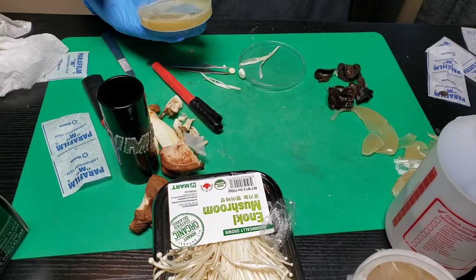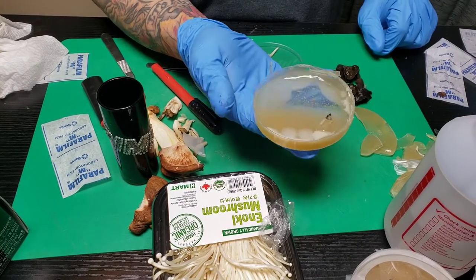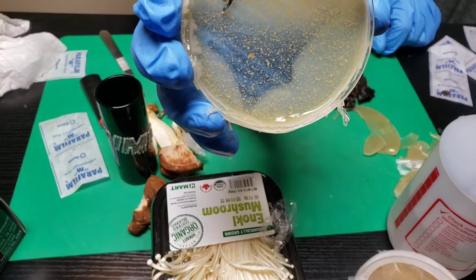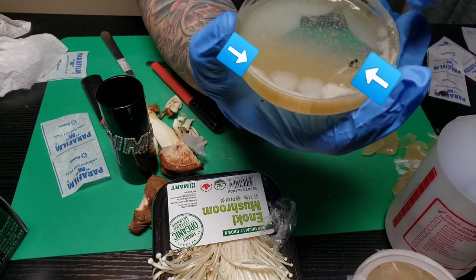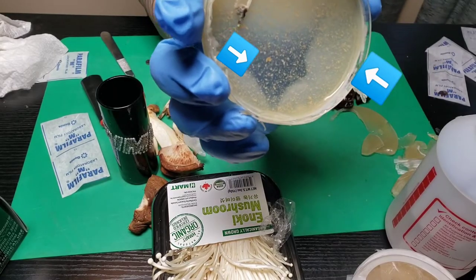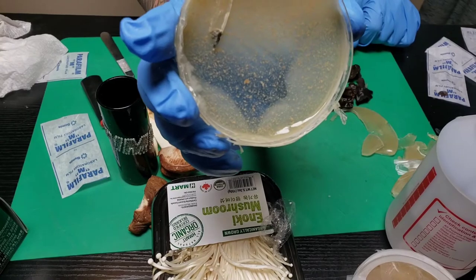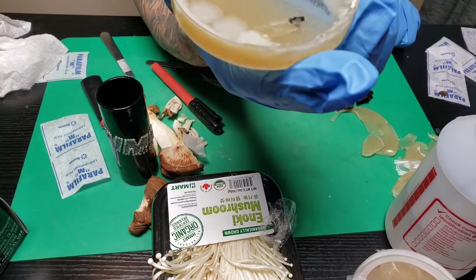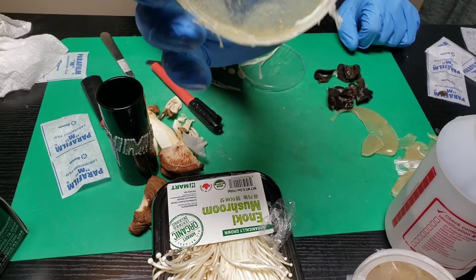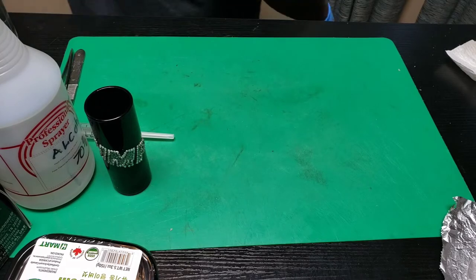I just wanted to show you real quick — I went to pull up my next petri dish and this is a petri dish that has gone bad. As you can see, it has some black around the rims and it is definitely growing something. What's growing there I don't know, but it's definitely not a mushroom. That is how important sterility is.